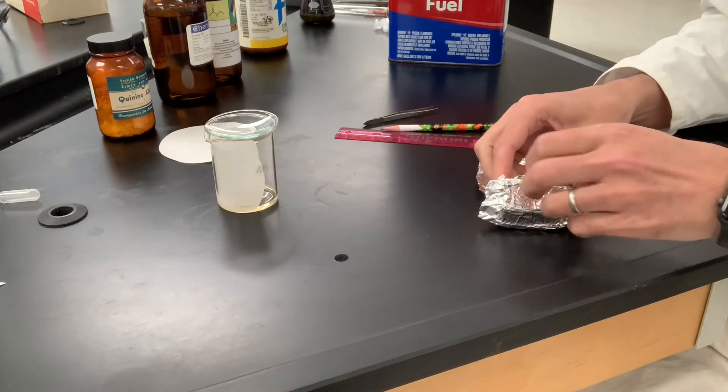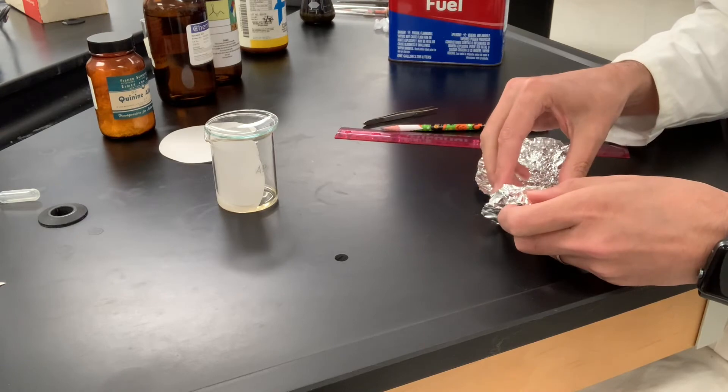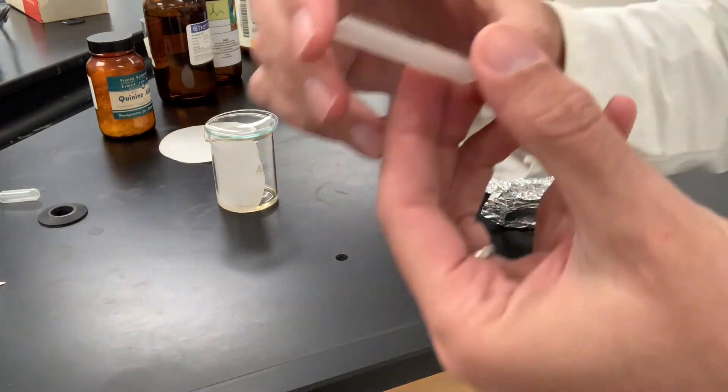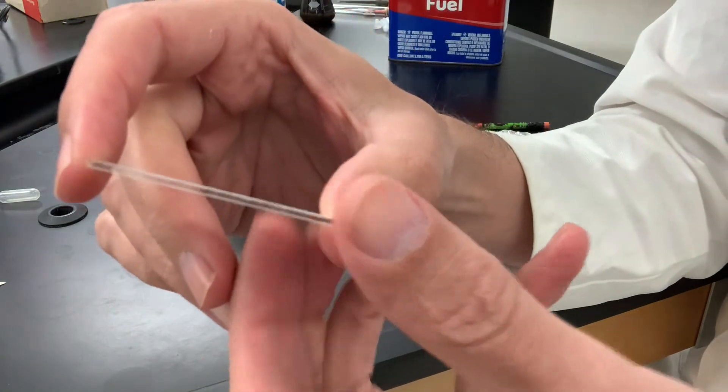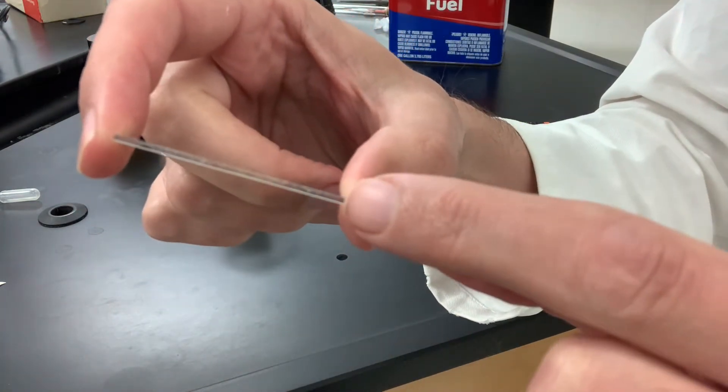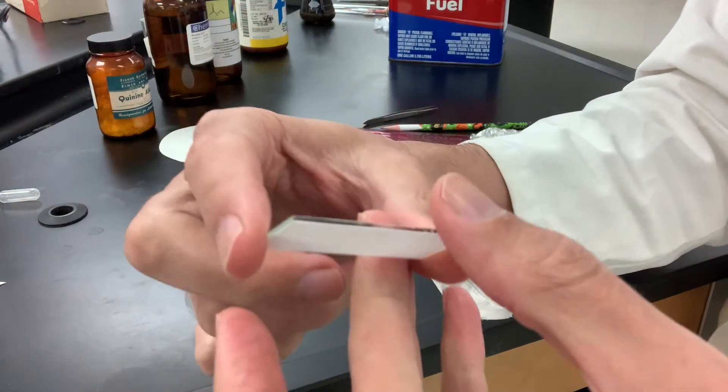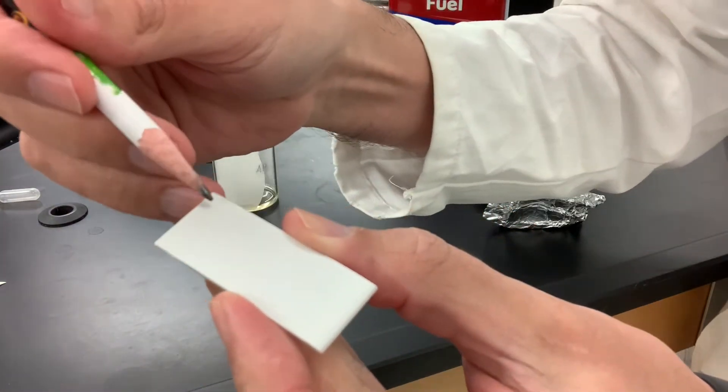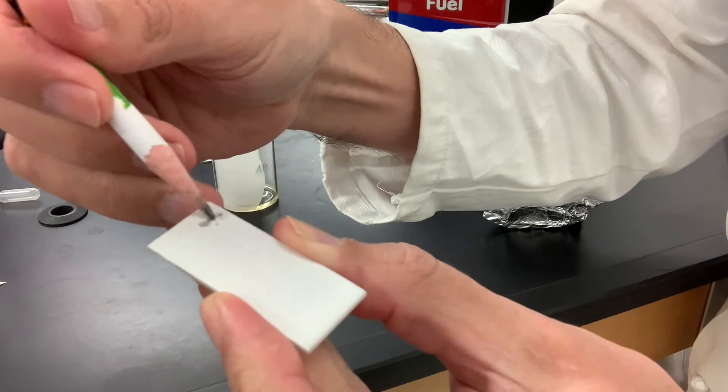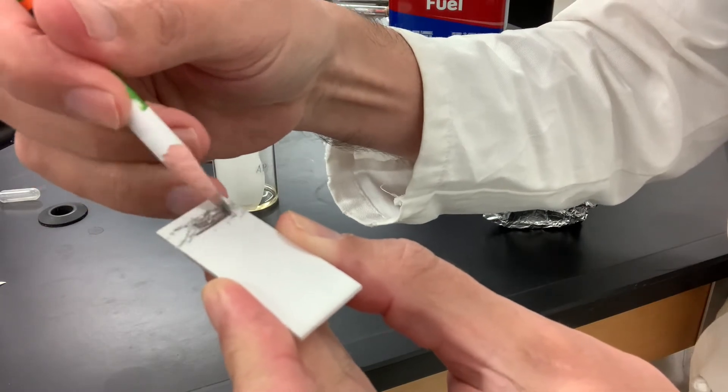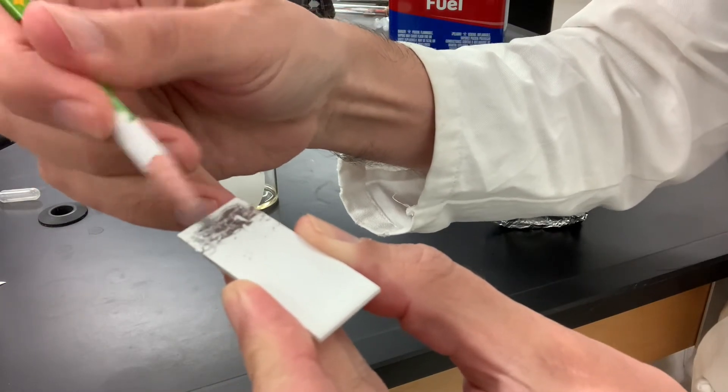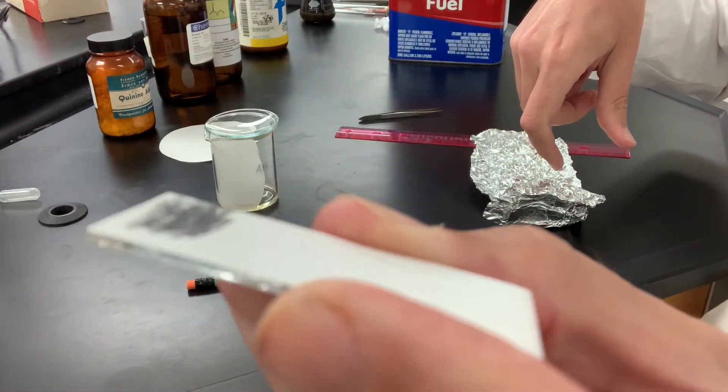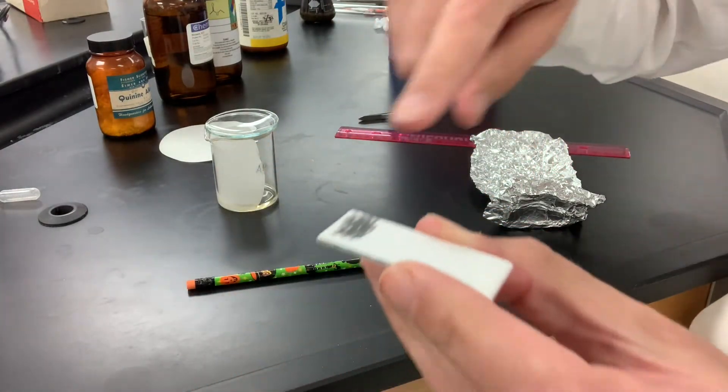Always handle the glass TLC plates by the edges. And if you look at this on its side, you can see that it's a piece of glass like a microscope slide, and then there's this thin layer of silica gel on the top. I'll just scratch it off so you can kind of see what that looks like. So it's just a very small thin layer of silica gel on there.